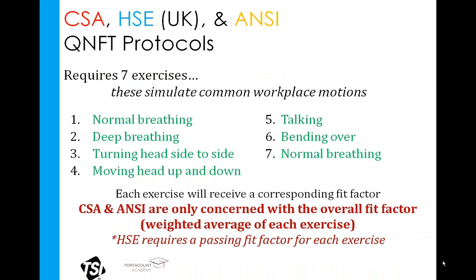Now before we move on to part 3, I just want to take some time here and discuss the other protocols other than OSHA: CSA out of Canada, HSE out of the UK, and ANSI. They all have roughly the same protocol, 7 exercises, basically minus the Grimace. They are also only concerned with the overall fit factor, except for HSE. HSE does require that every exercise have a passing fit factor.